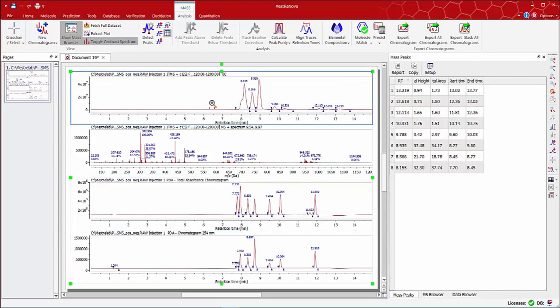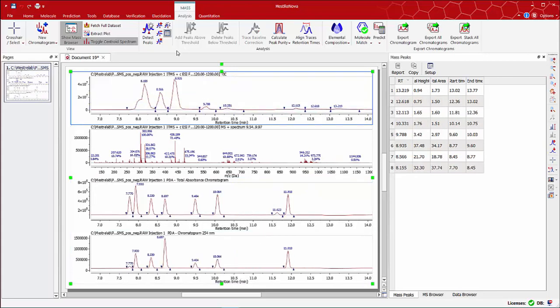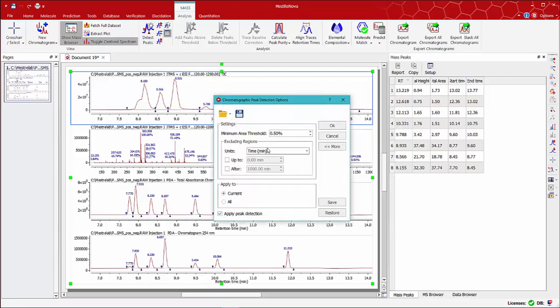With regard to the peak integration on the chromatogram, you can use the tool chromatographic peak detection option.